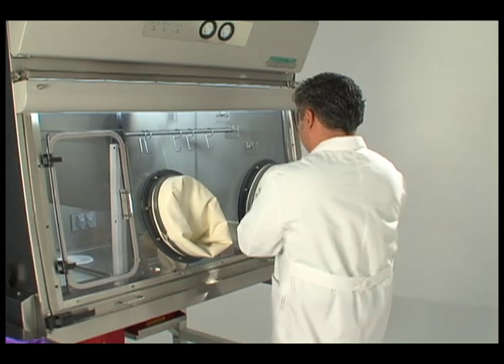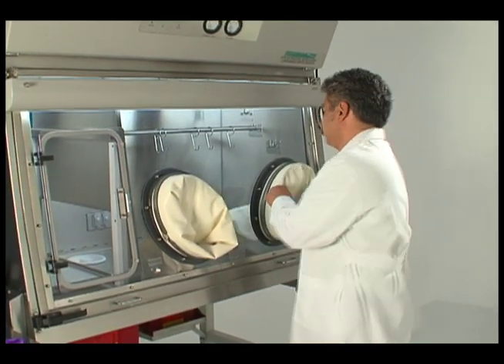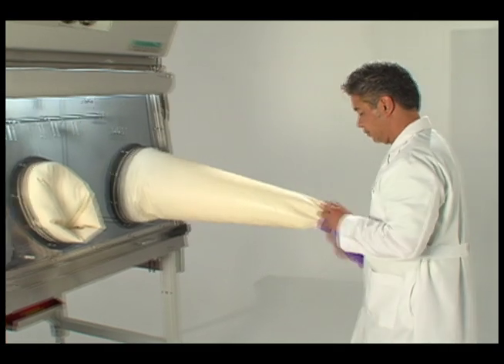First, invert the sleeve glove assembly by placing one hand into the glove and pulling it back through the glove port and out of the isolator.